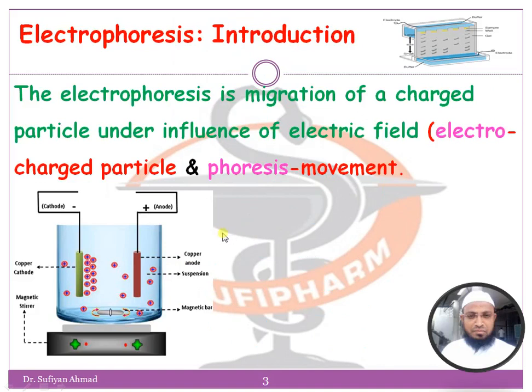Electrophoresis is the migration of charged particles under the influence of an electric field. Electro means the charged particle and phoresis means movement.